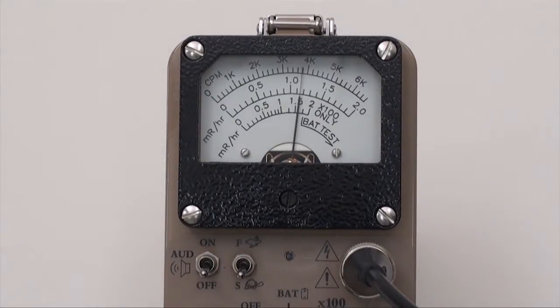In the slow position, the time constant is set to 22 seconds, resulting in less meter fluctuations and producing a more stable reading.